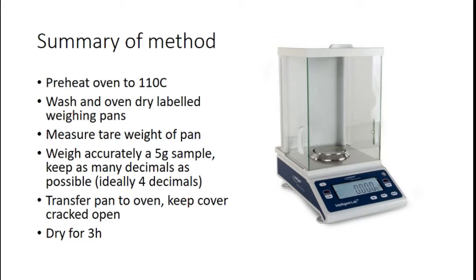AOAC methods encourage you to dry for approximately 3 hours. The main thing is you've got to dry so that the weight becomes stable. And so you may find, depending on the type of substrates that you're working on routinely, that 3 hours is more than enough and it can be shortened. And in other cases, you might find that 3 hours isn't enough and you may require additional time. The main thing is we're drying it so that the weight is stable and you do not see a change in weight with additional drying.